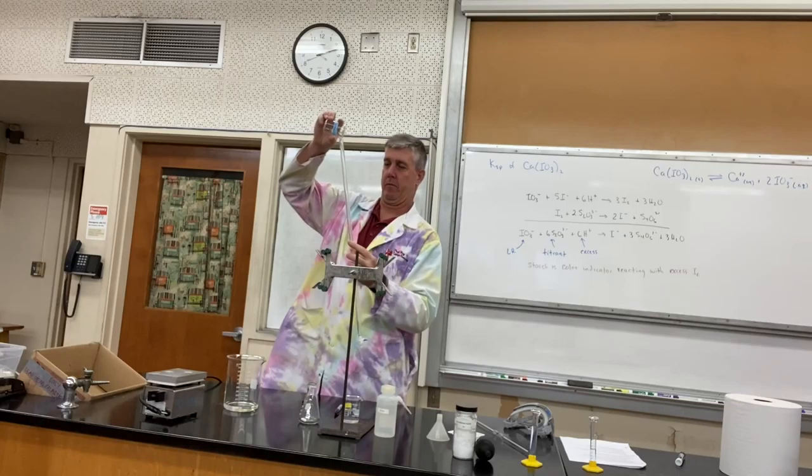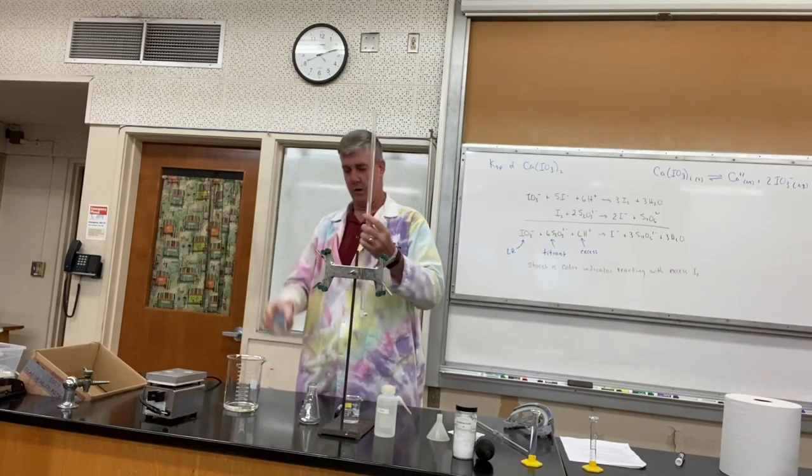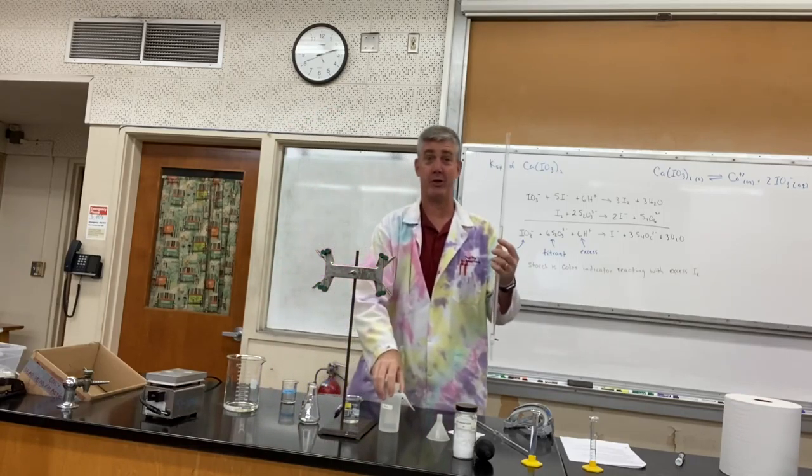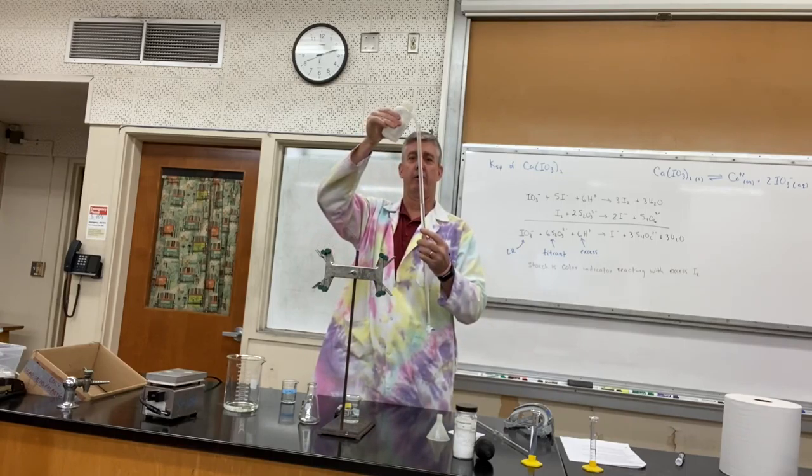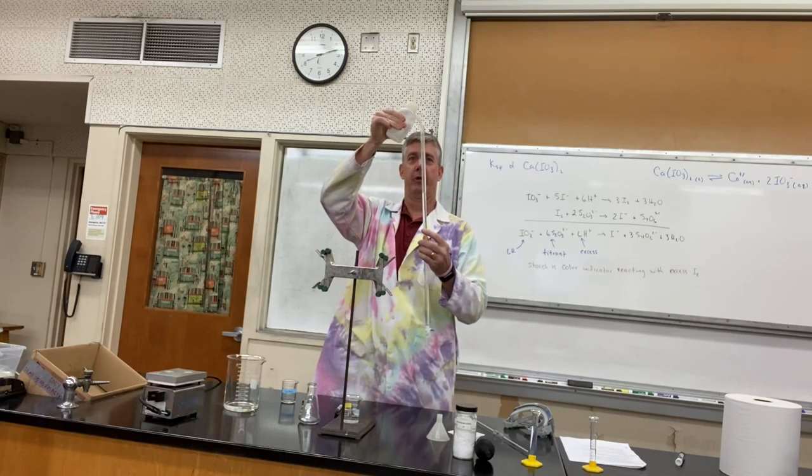If you can see, I'm just adding about that much of my titrant, about five, six, seven mils, letting some through the tip. And there we go.